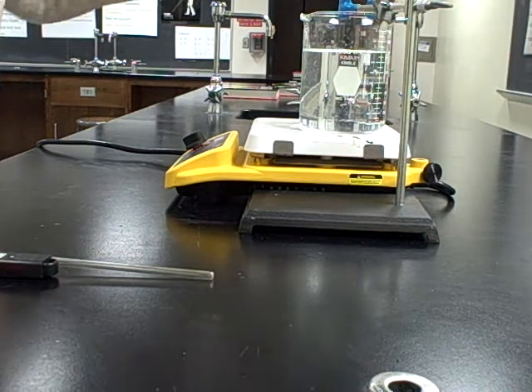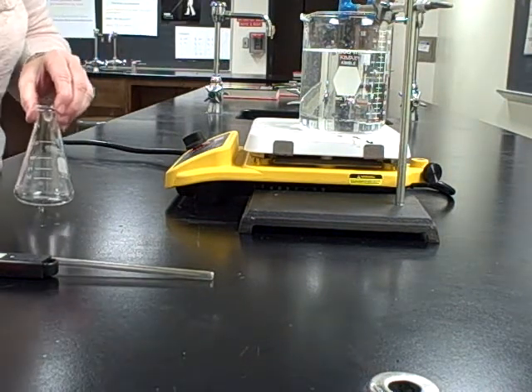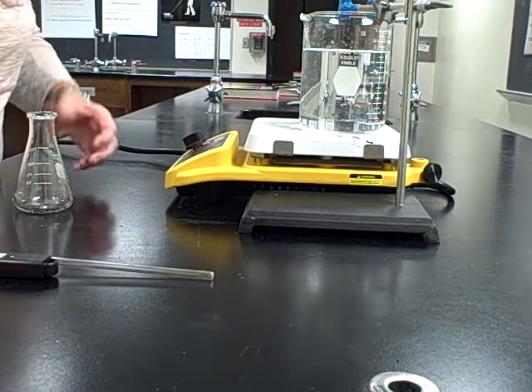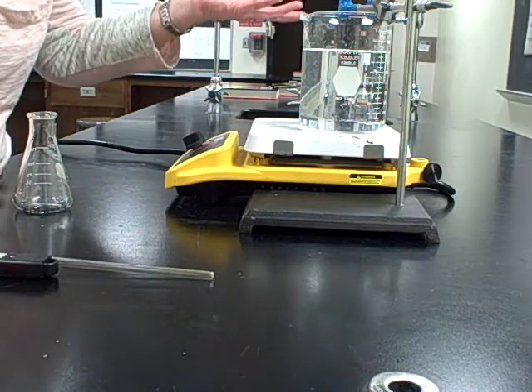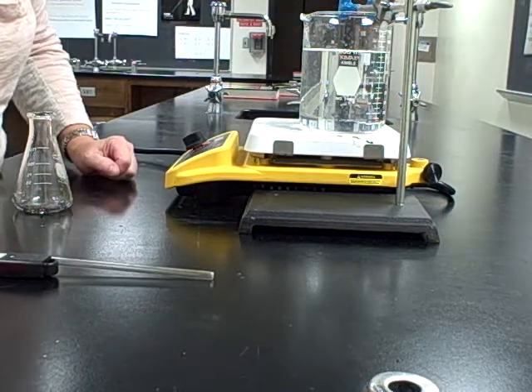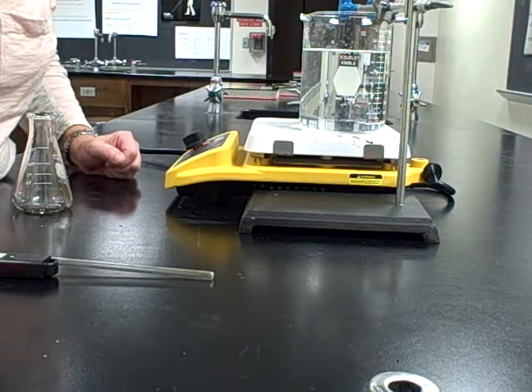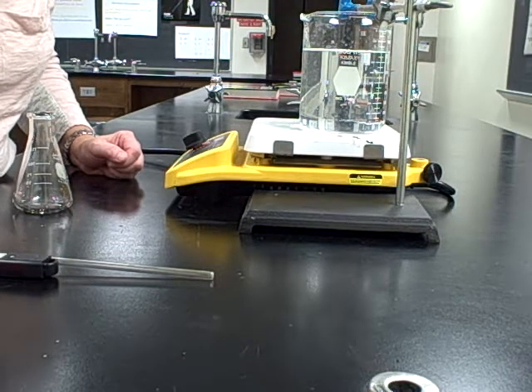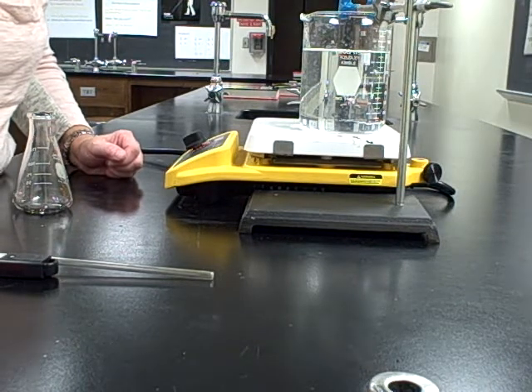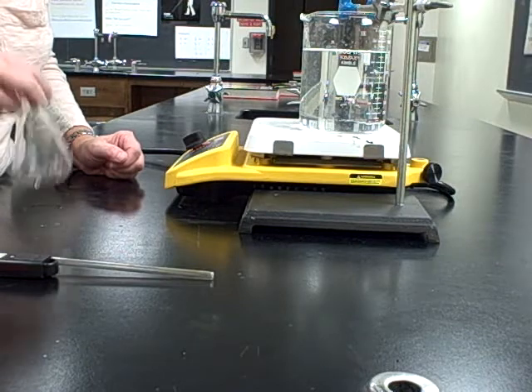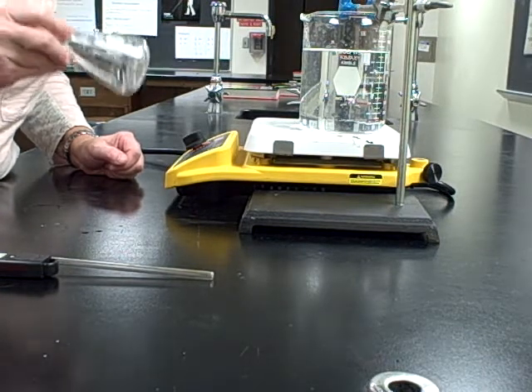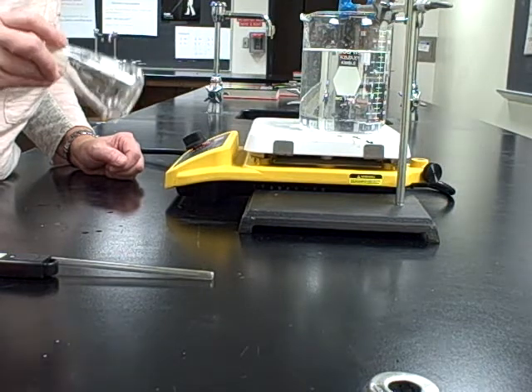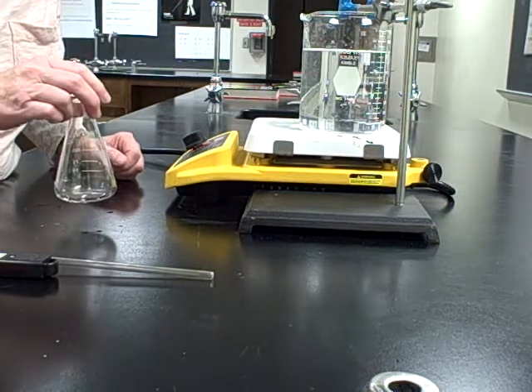Step two says go ahead and start heating the water bath on the hot plate to near boiling. You don't want it boiling or at least not boiling hard because then your water level is going to go down as it boils away fairly quickly. It says try to keep the temperature constant as this will be assumed to be the temperature of our gas. Especially when you're reaching the end of changing all the liquid inside this flask into a gas, you want to try and have a fairly constant temperature since you will use that in your calculations.